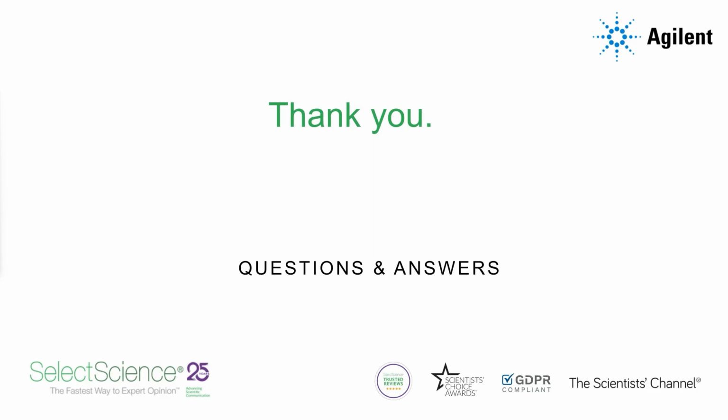I have another one here with somebody asking, how many different samples can you prepare in each Xdrop cartridge? The Xdrop cartridge is designed to prepare 8 different samples in parallel. So you essentially can run 8 different experiments in one cartridge. One cartridge takes about 8 minutes to run. So within 8 minutes, you have 8 different samples that you can then experiment with and analyze.